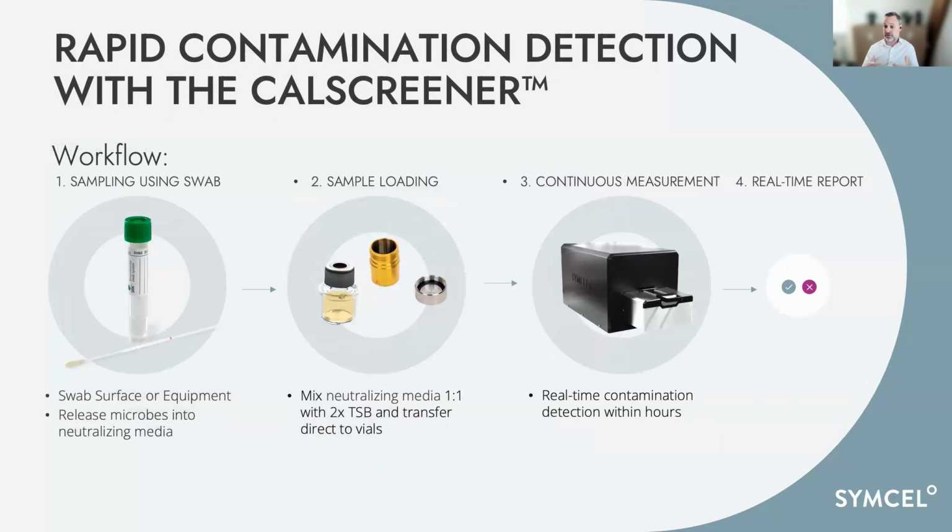Some of the workflows that we have worked with have been with swabs, but also other materials that are in a gnotobiotic setting. We've utilized these environmental swabs, I think we used Copan, but it could be any such system, and swabbed a very, very small amount of bacteria. Then we used this release buffer, where you put in the swab and it will release any microbes. This also neutralizes any residual detergents or antimicrobials you might have in your environment.